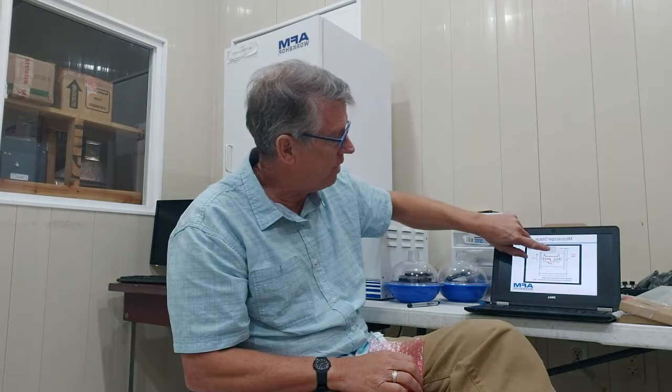So now we put this light lever AFM, it's a force sensor, on a Z drive. That's a stepper motor on a linear translator, and it drives this whole thing up and down. You saw that yesterday. I come in the back, and I'll turn that thing to move it up and down by hand. But you can do it electronically, of course.